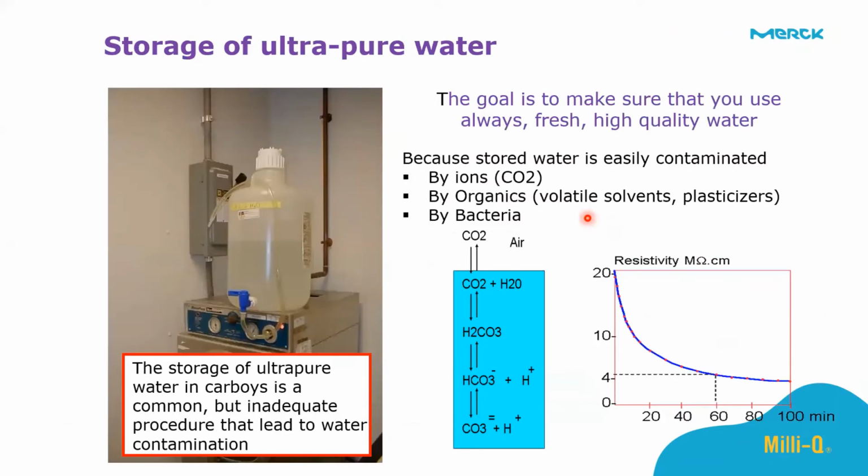And this can be seen in this experiment that was done actually in our labs, where we had ultra pure water that was displayed in the lab in a beaker. At time 0, as we dispensed the water from our system, putting it in that small beaker, the resistivity was 18.2 at 25 degrees. But after 1 hour, you can see the resistivity had fallen to slightly above 4 megaohm. So degradation started almost immediately.